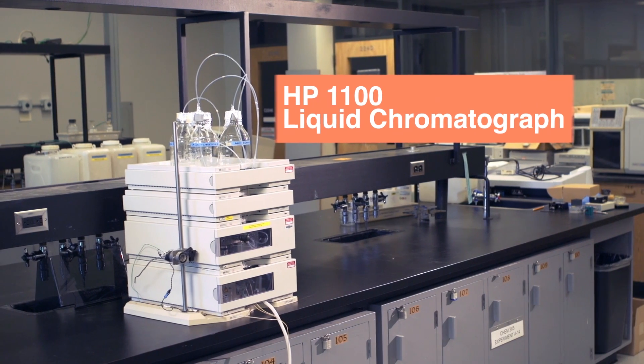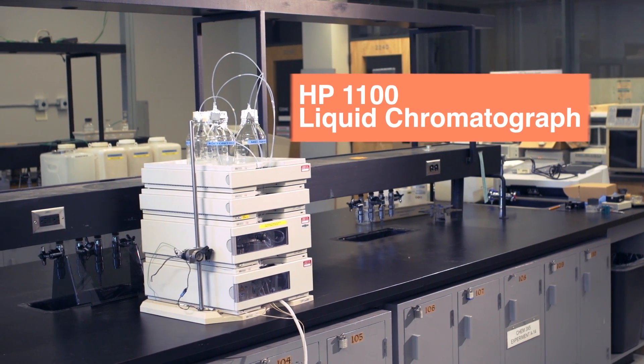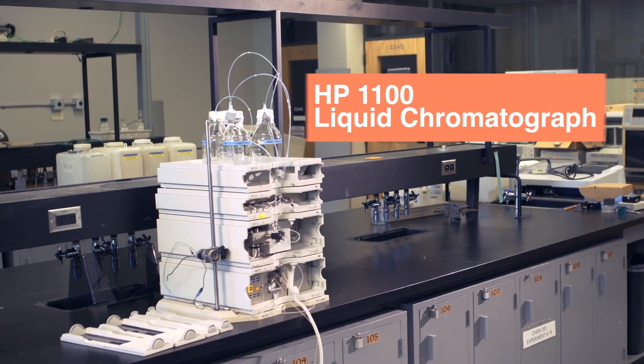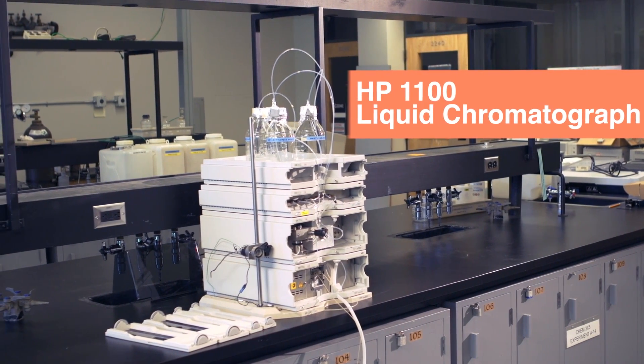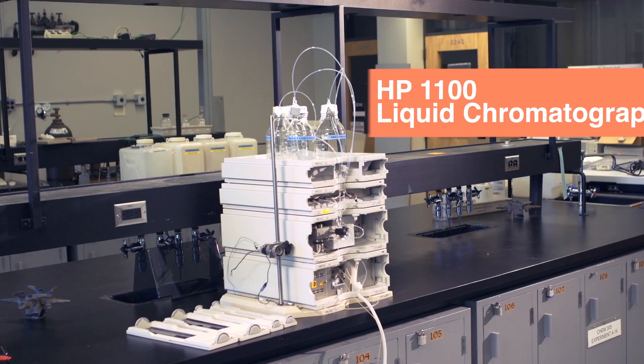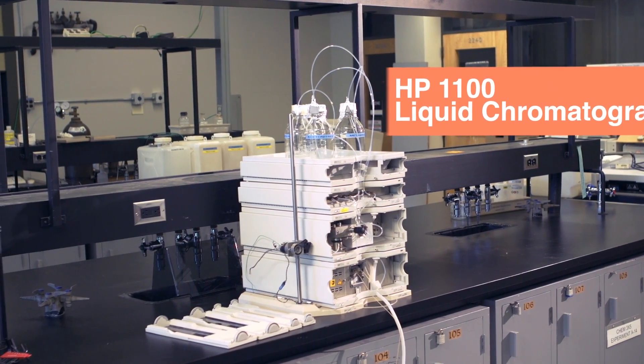The instrument we're looking at is the Hewlett Packard or HP 1100 liquid chromatograph. The HP 1100 design is modular and we'll look at the various components. What we will see today can be generally applied to other liquid chromatograph systems.